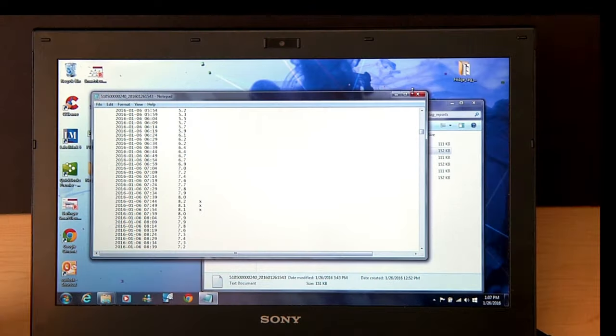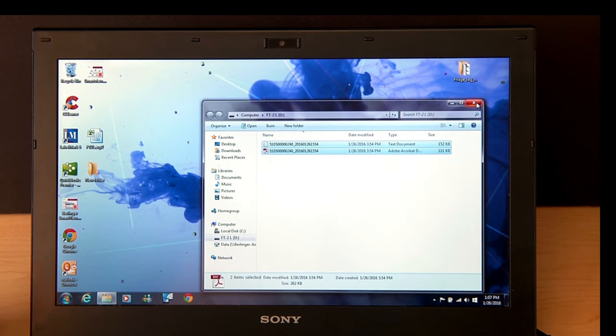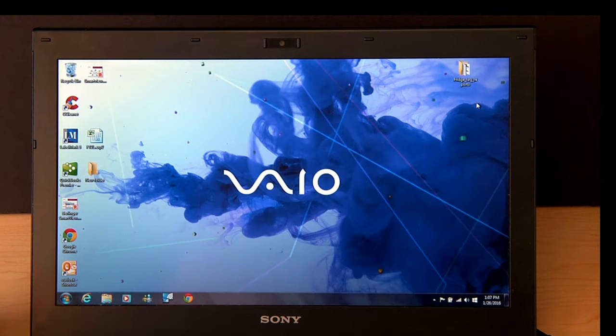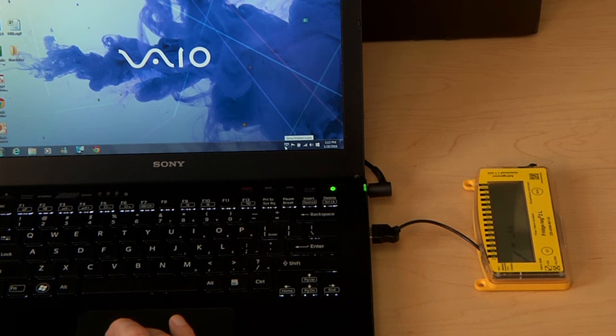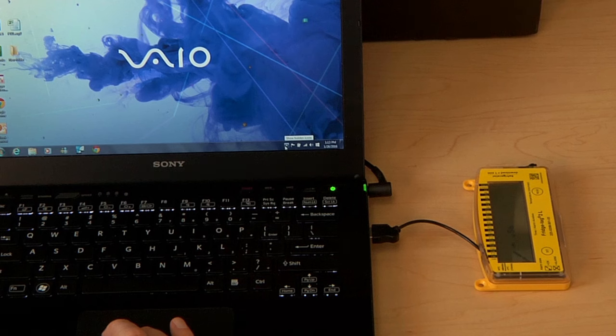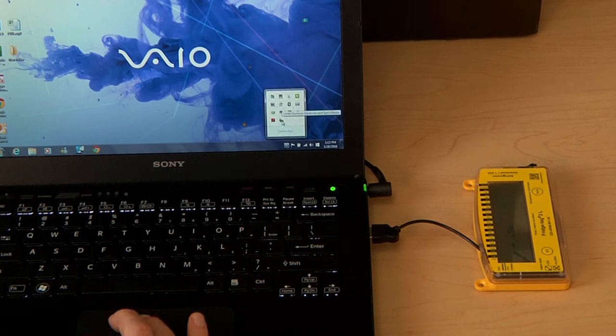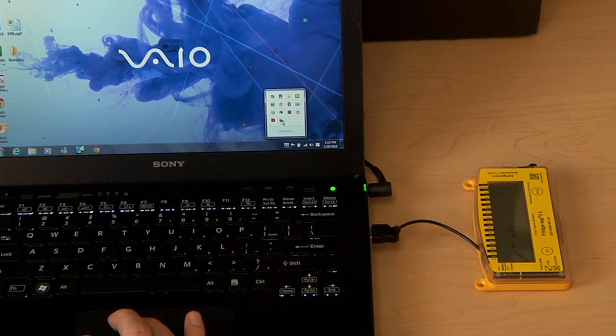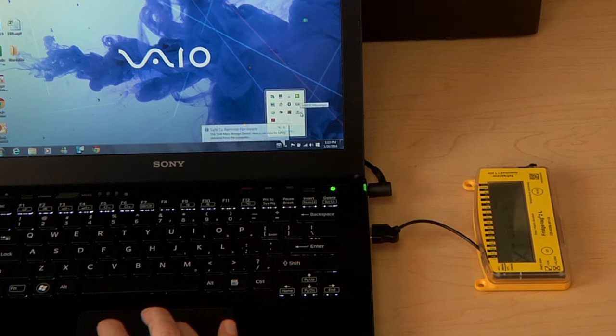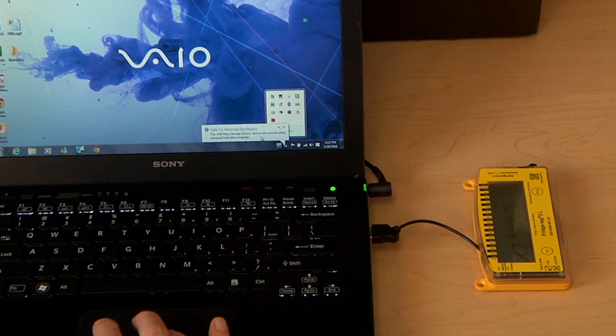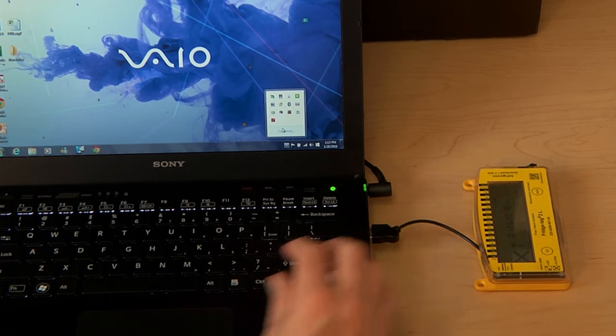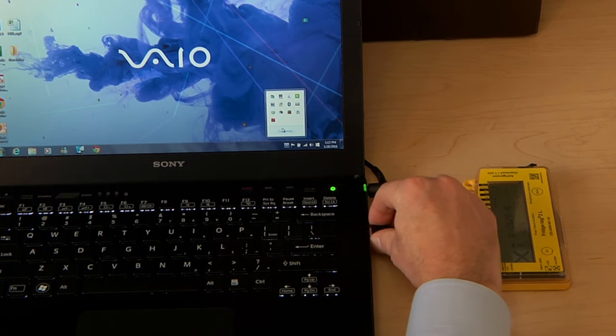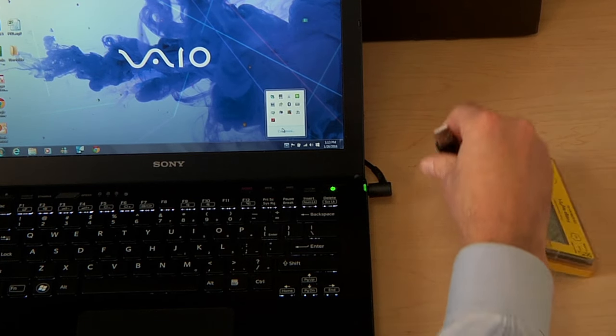When you're through downloading your reports, be sure to safely remove your Fridgetag or Fridgetag 2L from your PC. On this PC, we click the small arrow, choose safely remove hardware, and then choose the Fridgetag 2L. Now that it says it's safe to remove the hardware, we can disconnect it from the PC or Mac.